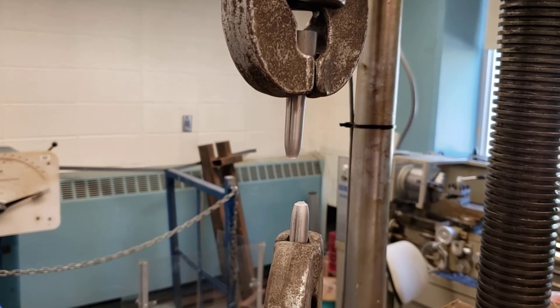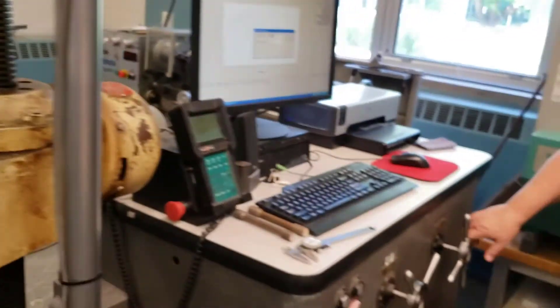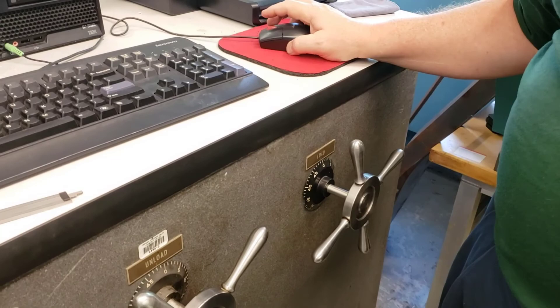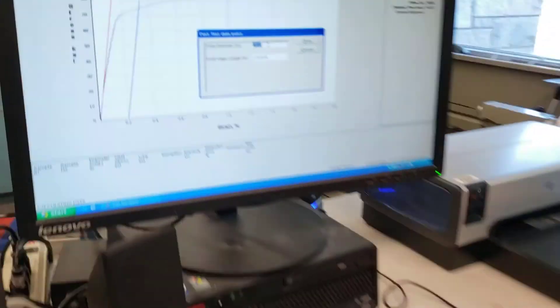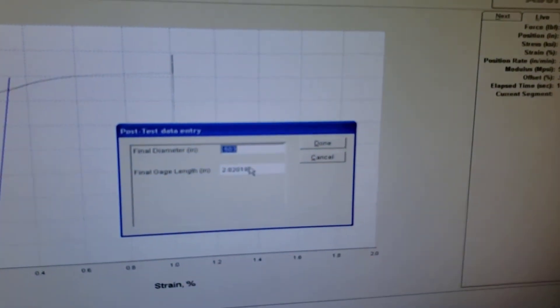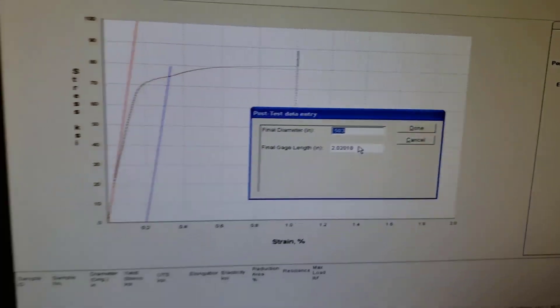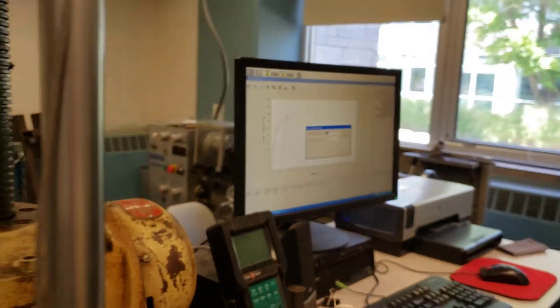As soon as the specimen breaks, we close the load. Now we need to enter two pieces of information into the computer: the final diameter and the length of the sample.